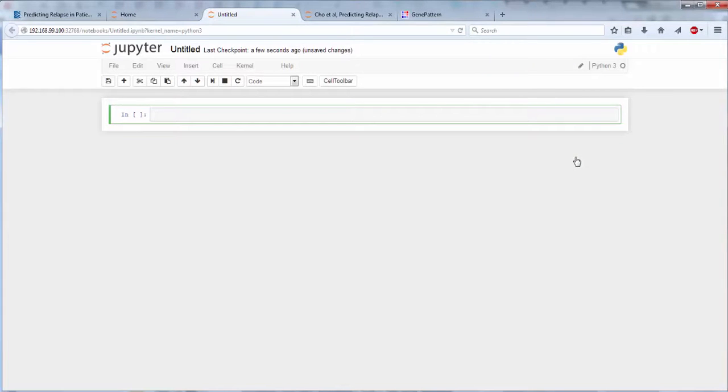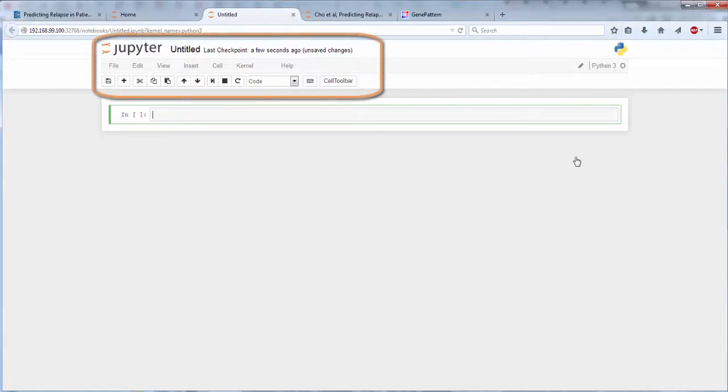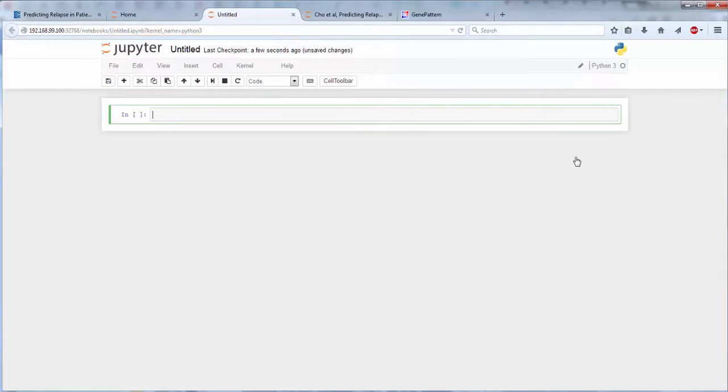Here you see the familiar Jupyter Notebook interface, including the Jupyter menu, providing access to the notebook capabilities. To build a new notebook, you add cells containing different types of data.